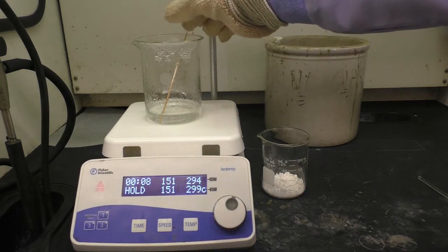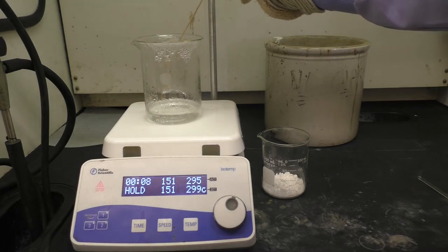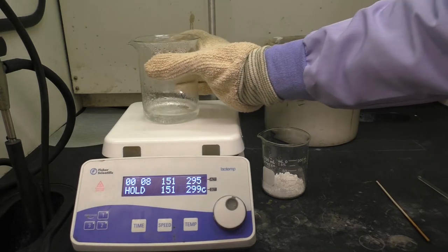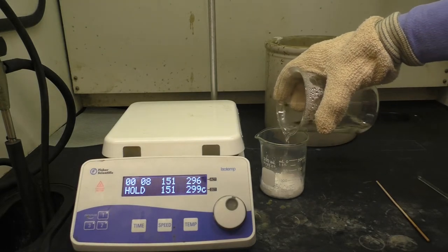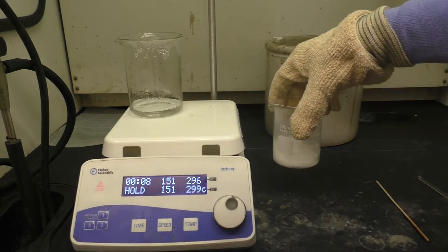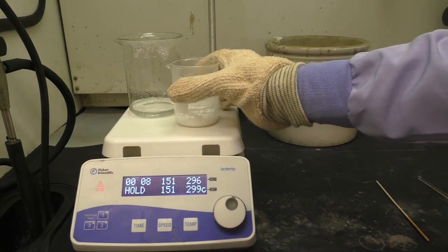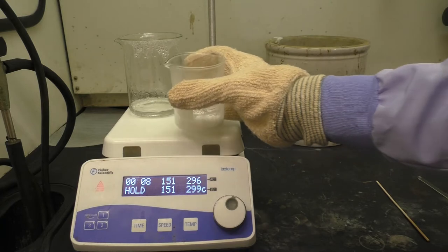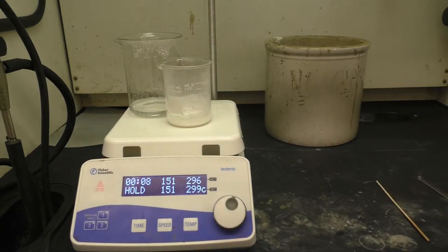So I'll take some oven gloves. I'll remove the boiling stick from the boiling water here. I'll initially just pour some of this in to help cover the bottom surface there. Swirl that around some, and then place this directly on the hot plate. Now you'll notice most of the material is still not dissolved in any way, shape, or form. But I'm going to place it right on the hot plate there.